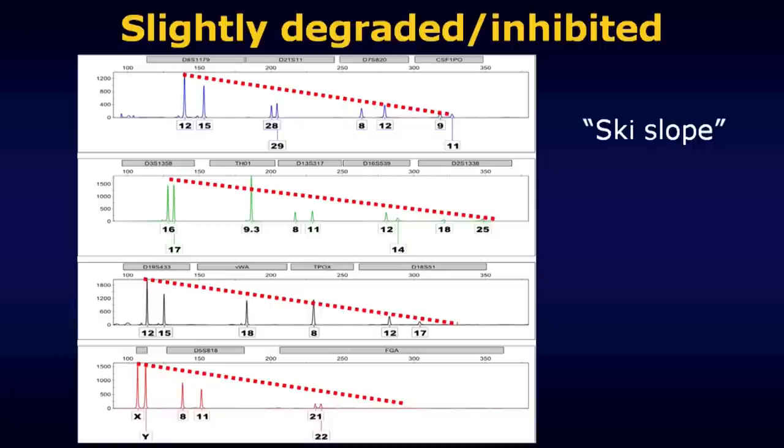This has all the hallmarks. It looks to me, and I hope it looks to you, as a sample that has experienced, at the very least, degradation, maybe inhibition, maybe both. Can't necessarily say which has predominated, but this is a sample that looks as if it's been degraded or inhibited.